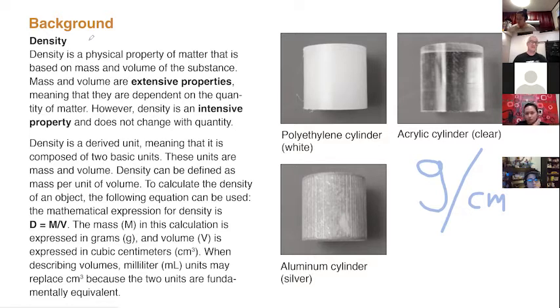And the reason is that, what's the density of water? Anyone remember what the density of water is? That's something you're going to be measuring tonight, actually. What do we expect to find when we calculate the density of water?